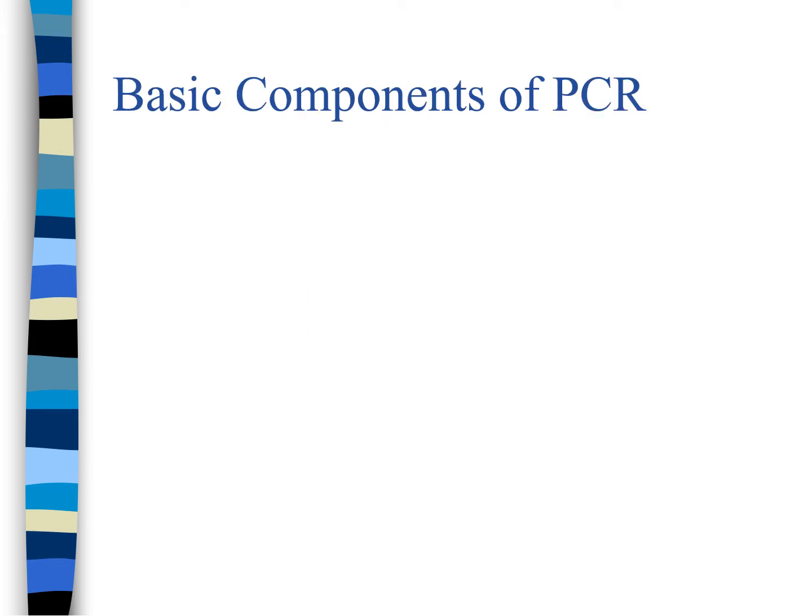What are the components of PCR? Let's say we have the purified DNA from last class, which is the DNA from the patient, from the blood that we obtained. We want to see if the patient has the leukemia gene. This sample has the 46 chromosomes, and there are many genes on each chromosome, but we only want that CML leukemia gene. And this is what PCR does.